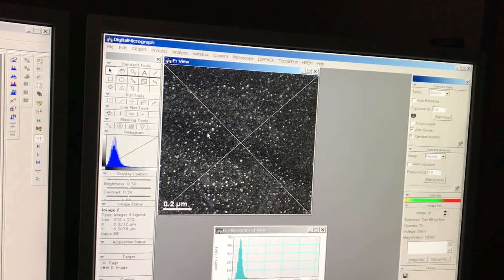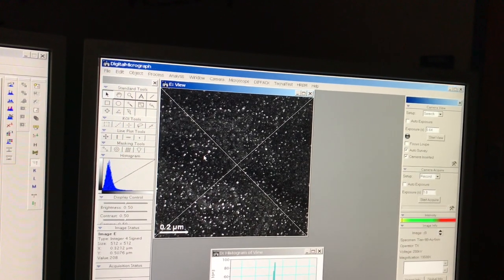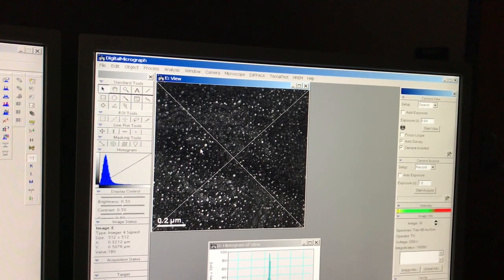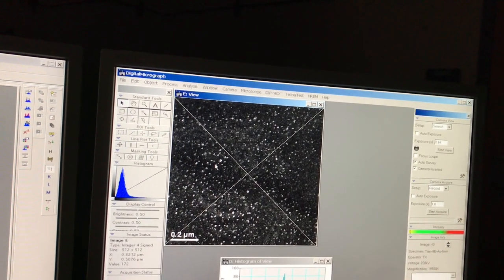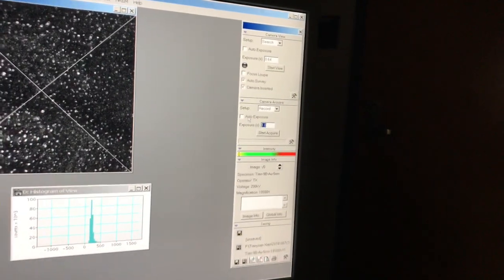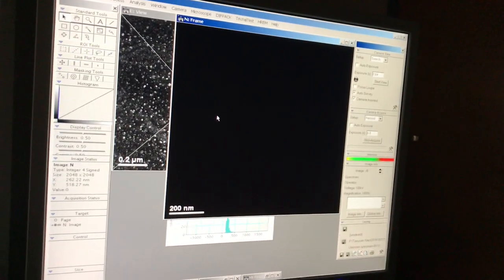When I'm doing bright field imaging. Okay, and so now we can actually see that compared to any of the images we've seen before, my faults actually look way more distinct, again, compared to the non-defective background. It's not uncommon to use several seconds for your exposure times when you do this. I'm going to put 6 seconds in. This is going to take a little bit here.